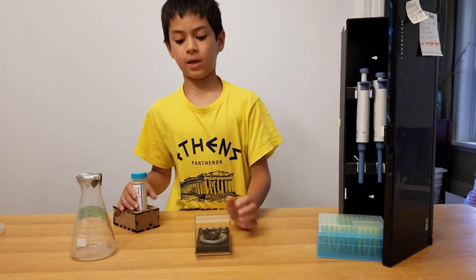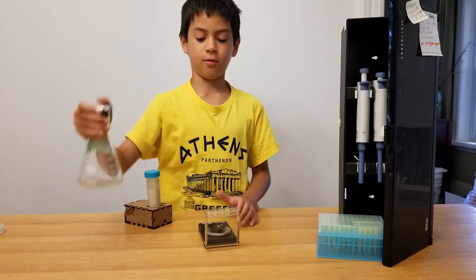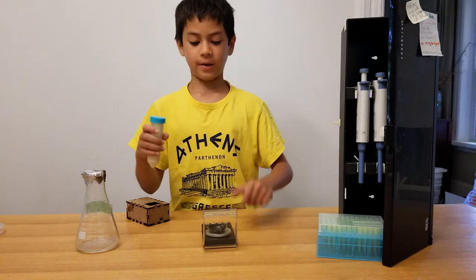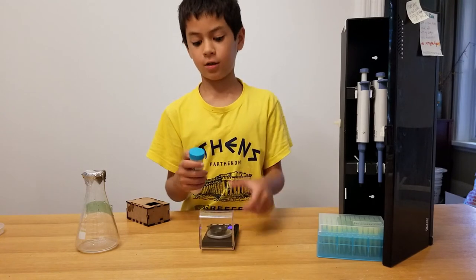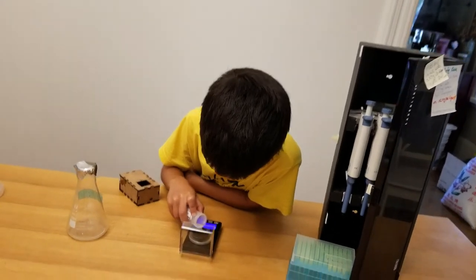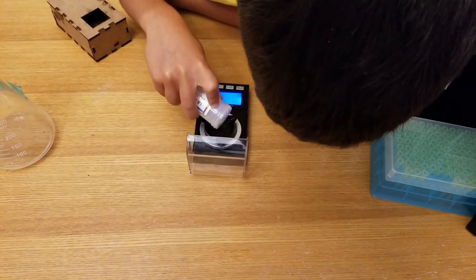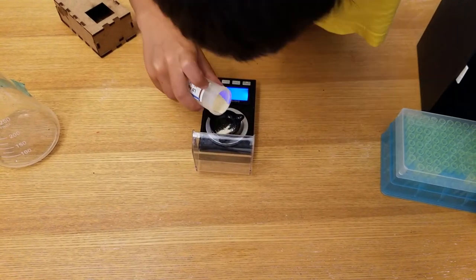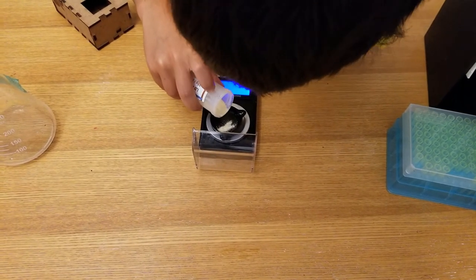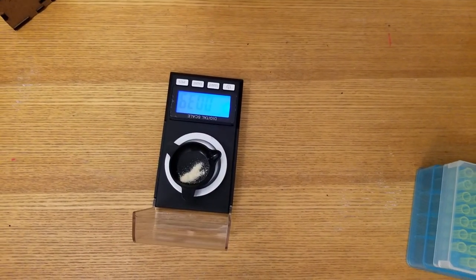Now we're gonna measure the LB agar on a scale — basically the same as what we just did with the water, just slightly different because we're using a solid. We have to be very careful and pour very slowly so it doesn't all splatter out. It reads 0.39 grams, which is very close to 0.37 — it'll work if it's slightly off.